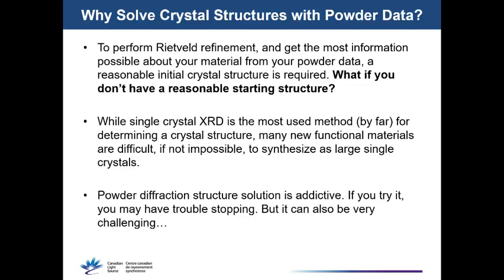I like to kid them saying that it's powder diffraction one crystal at a time. But they do manage to get single crystal data from each one of these single crystals, and eventually wind up accumulating enough spots on their detectors to get a single crystal data set from a whole string of 1 micron crystals. But that's really the exception.